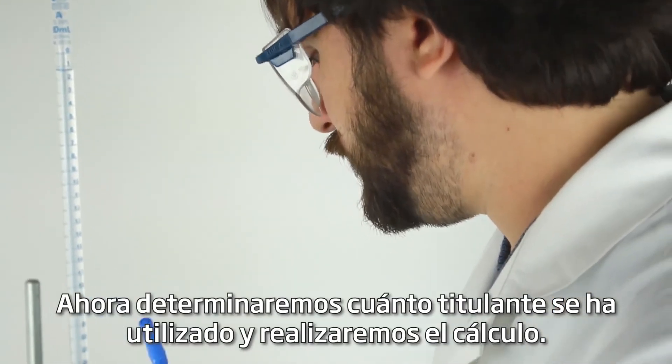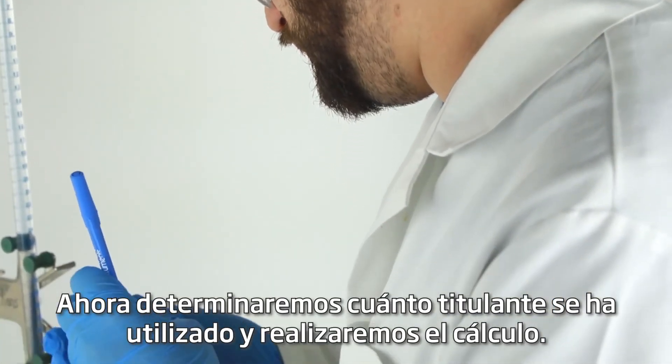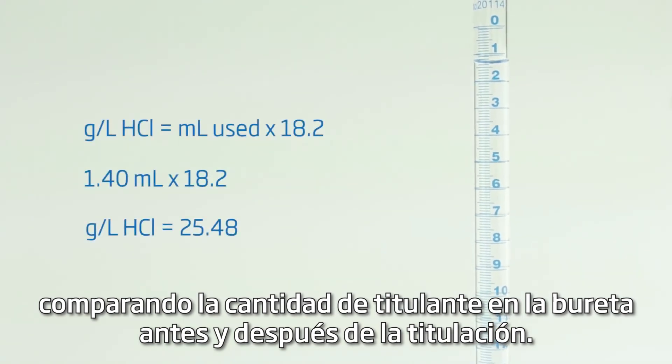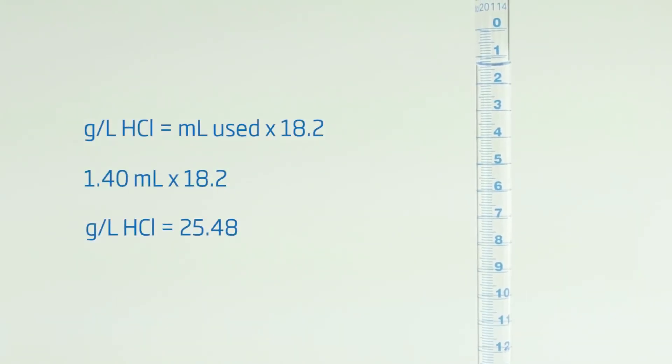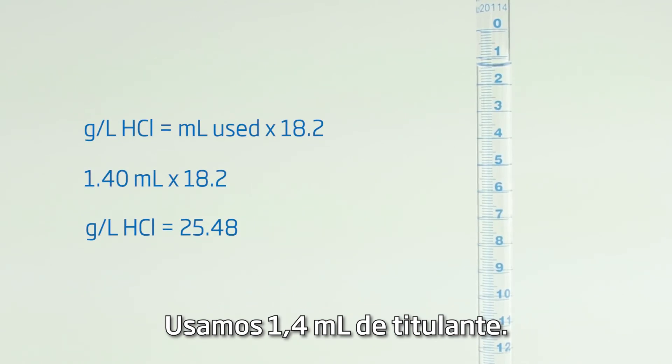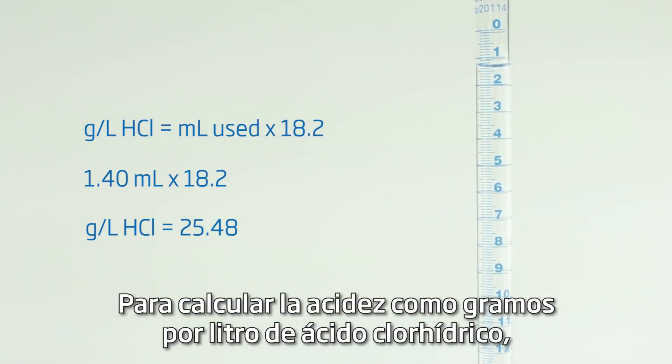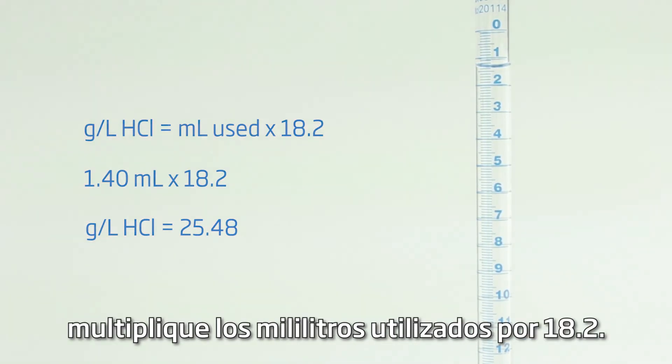Now we'll determine how much titrant we used and perform the calculation. Reading the meniscus, we can determine exactly how much titrant we used by comparing the amount in the burette before and after titration. We used 1.4 milliliters of titrant. To calculate acidity as grams per liter of hydrochloric acid, multiply the milliliters used by 18.2.